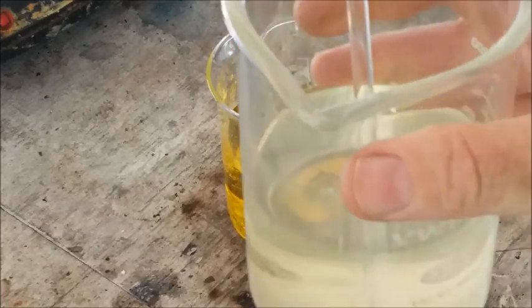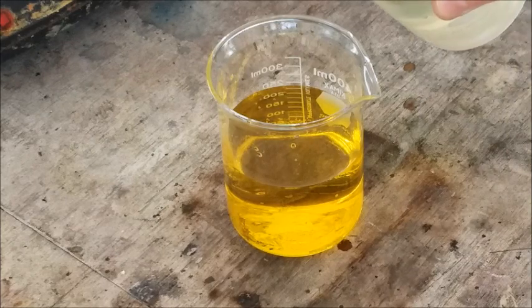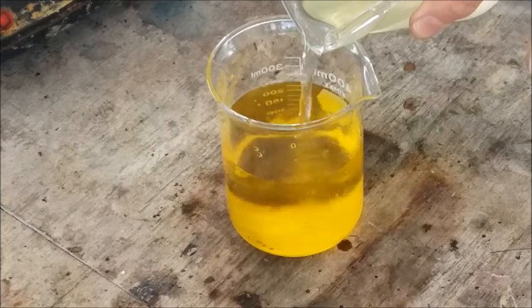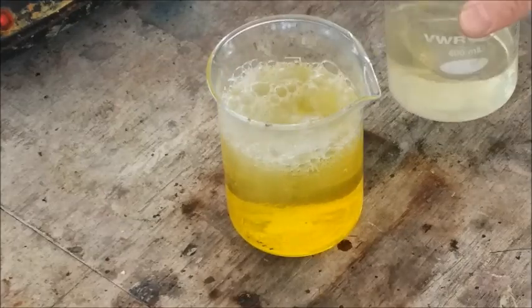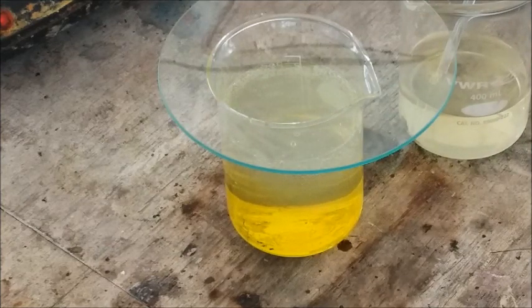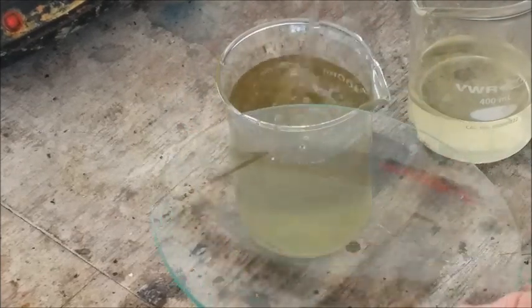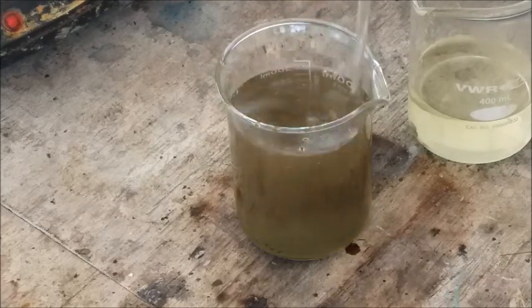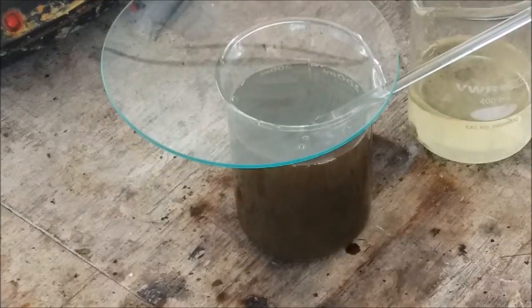So I've got a very strong solution of sodium metabisulfite here. Sorry, kicked the camera leg. Ah, there we go. I'm starting to wonder if I had enough in there. But there's the magic color change. All right, now we just gotta wait and see what falls out of solution.